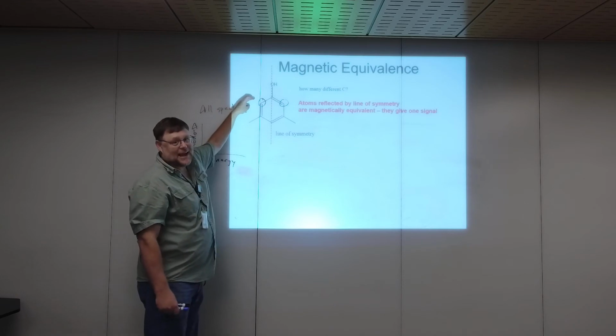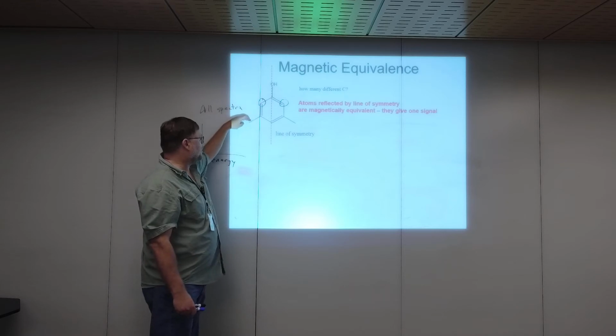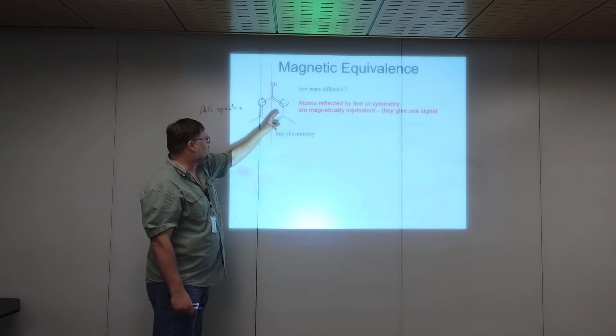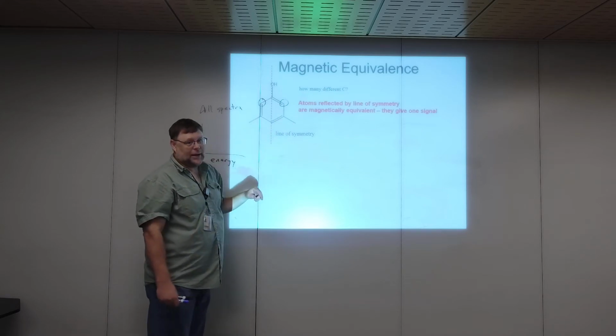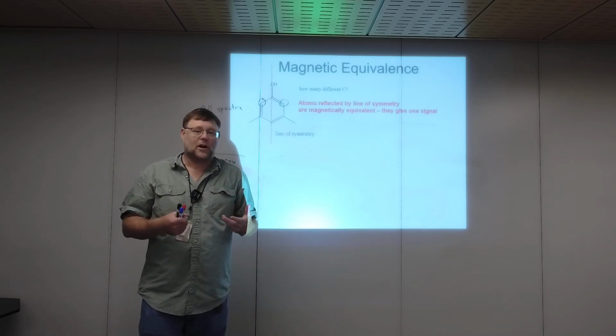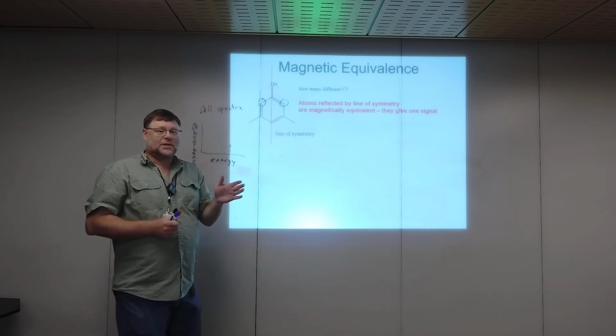All of that fits exactly with this one, right? sp2 carbon bonded to an sp2 carbon with a methyl, an sp2 carbon with an OH, across from an sp2 carbon with a methyl, and one off sp2 carbons with an H. The electronic environment around those two circled carbons is exactly the same. So they're going to give one signal.